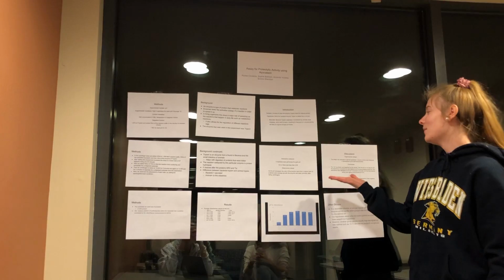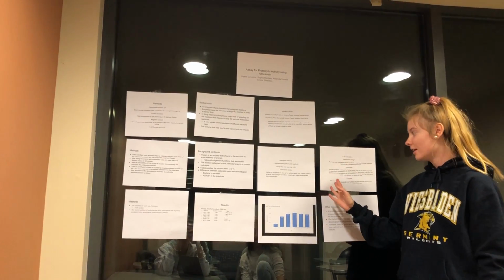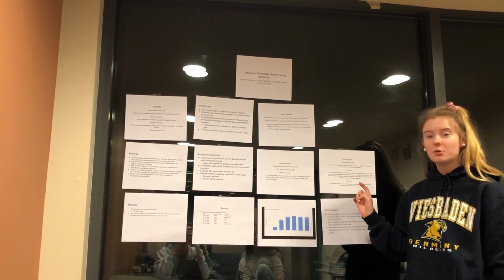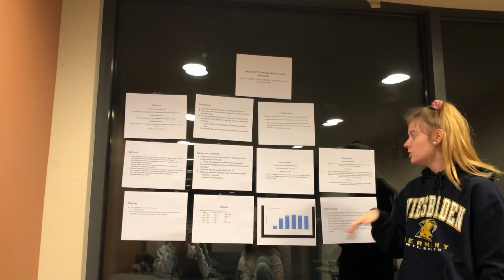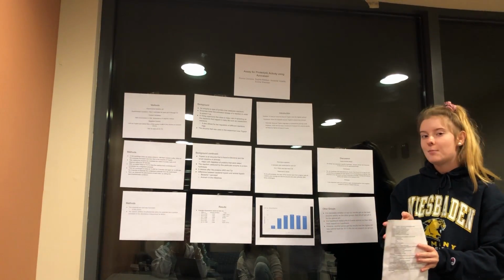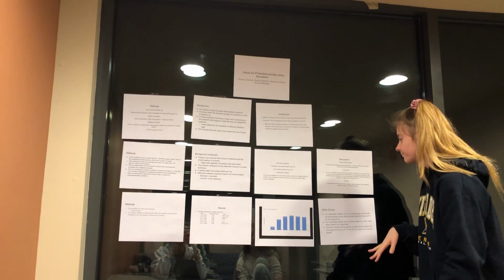Our descriptive statistics were that we had 3 replicates performed for each pH. Our p-value was less than 0.05, and in our observations, as the pH increased, the color of the solution went from a lighter color to a darker color. It was an orange-red with the enzyme, and then a clear yellowish after it had been centrifuged.